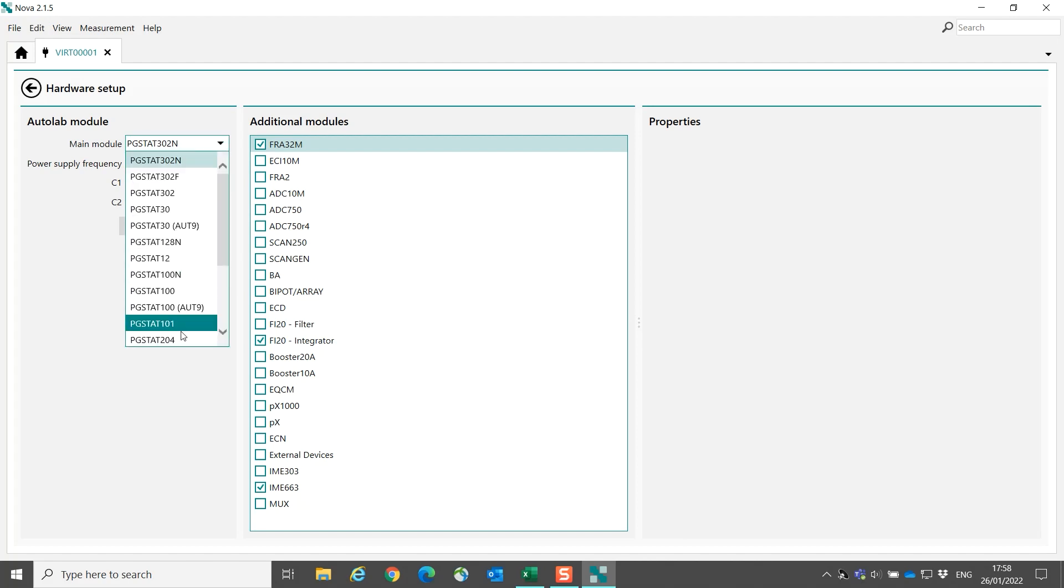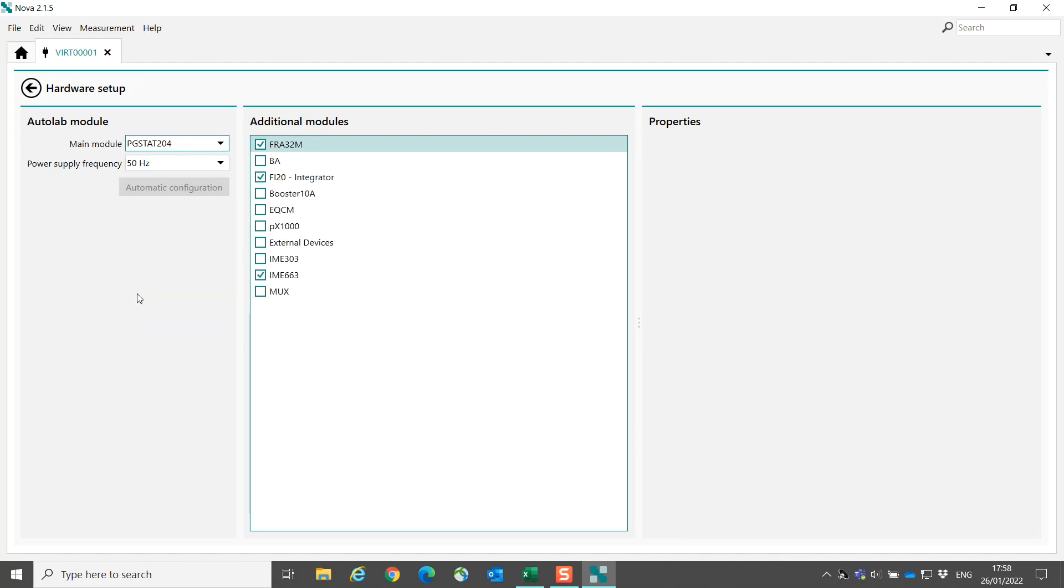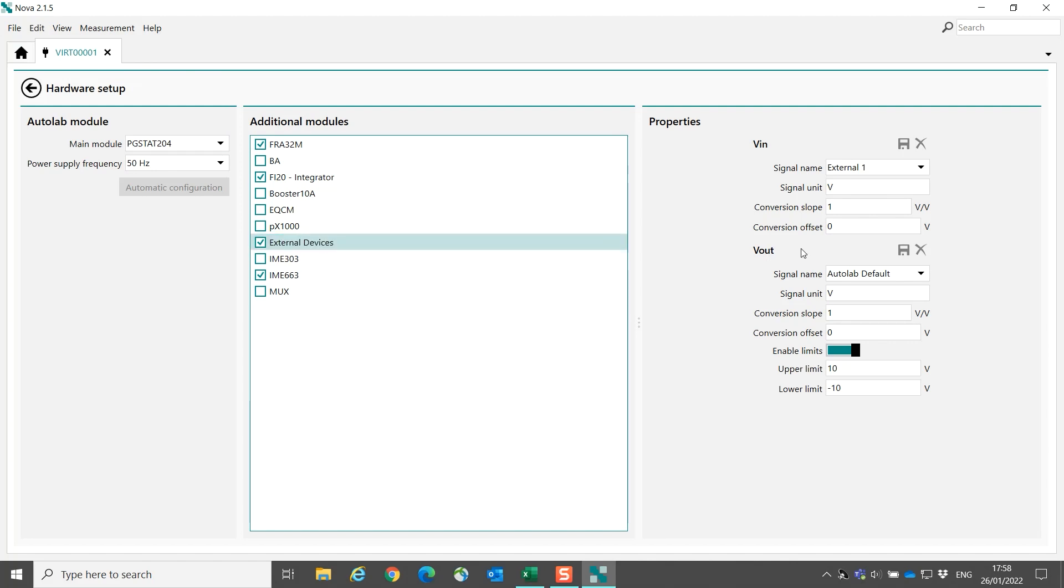The rotating disk electrode is controlled through the monitor cable of the PG-Stat 204. Then we have to select external devices. And in the Vout of the monitor cable, we select the Autolab RDE. And now the settings are configured for the 204.